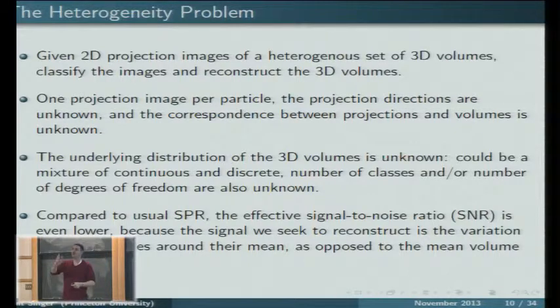Right. The energy landscape, say, of a protein can be very, very complicated, and it can jump from one state to another and still be folded. These foldings are, as I understand, fairly tight foldings, right? Yeah, but like I'm saying, there can be several states. It can stay for a long time in one state, and then switch to another state rapidly.